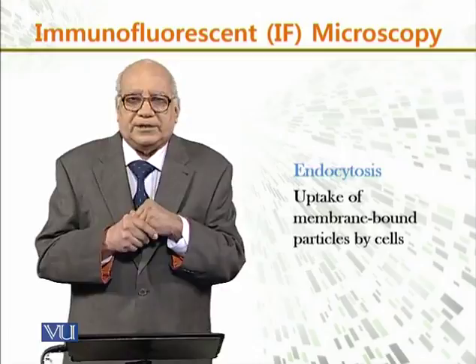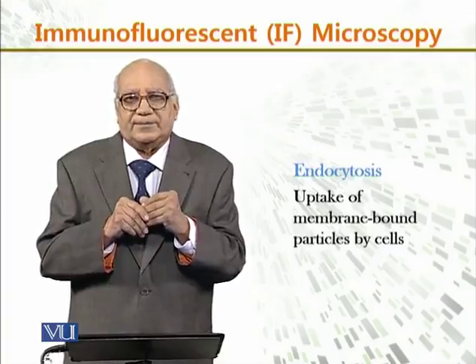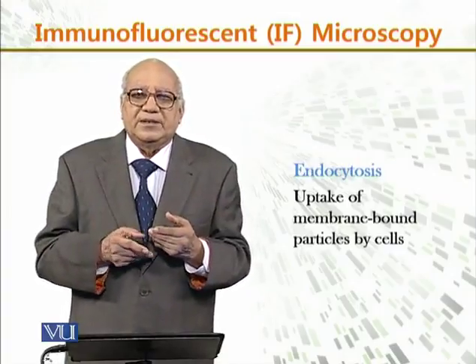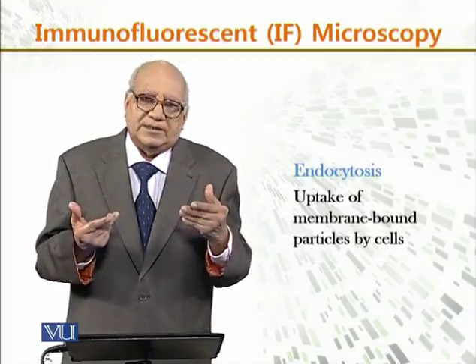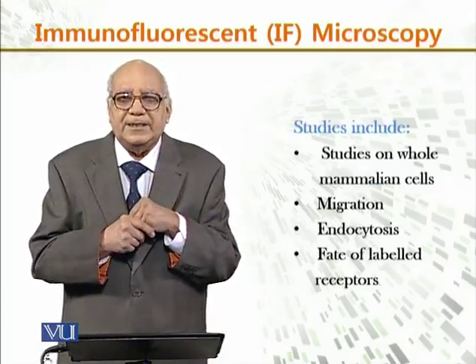Now, endocytosis, that is the uptake of membrane-bound particles by the cells. You see, the membranes which are present around the cells take up certain particles, and that can also be determined by the IF technique.